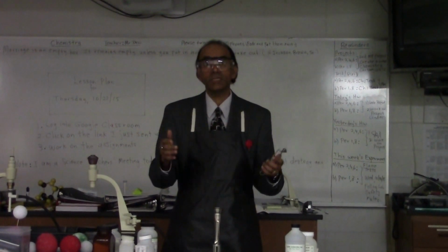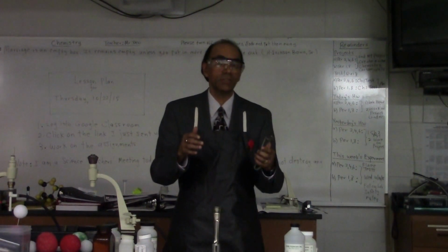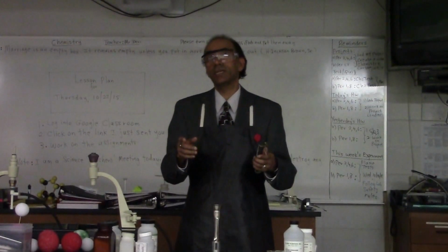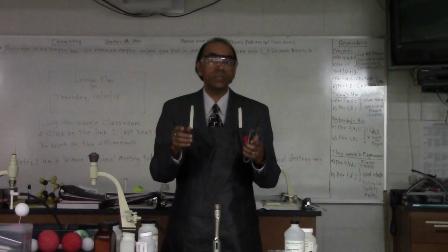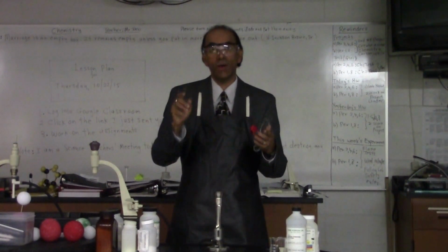Today I have a really interesting experiment to do for you. It's called a flame test experiment, and it's actually used in order to identify metals in metal salts. And it's going to be really exciting in the sense that when you go to watch the Macy's 4th of July fireworks, you'll be able to identify all the different metals that were used in the fireworks, okay?